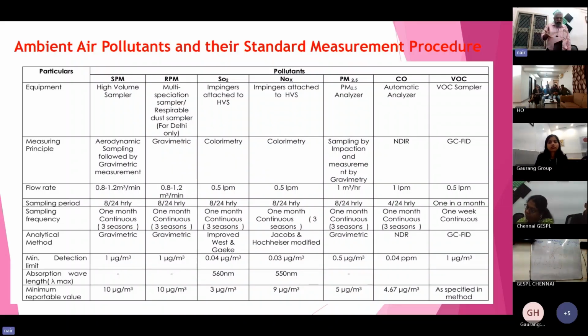Do you know that it has two sides? Okay, sir, two sides. How will you put it? I will put it where the number is there, the other side I will put down. Okay, finish. Then on the side where the impeller is, what is there? Water only. Why do you put water? Sir, we put water for 8 hours and take the sample and send it to the lab. See, you will not get anything.